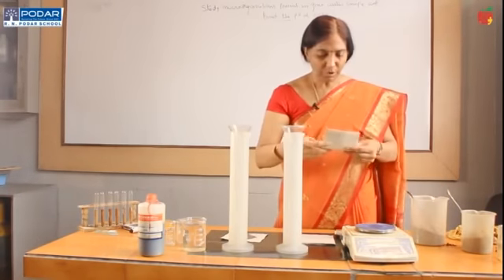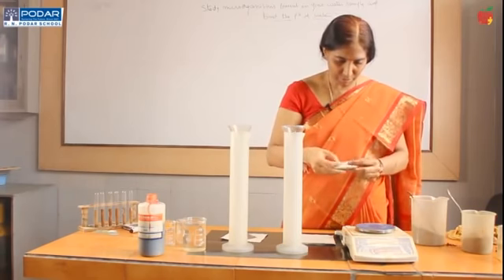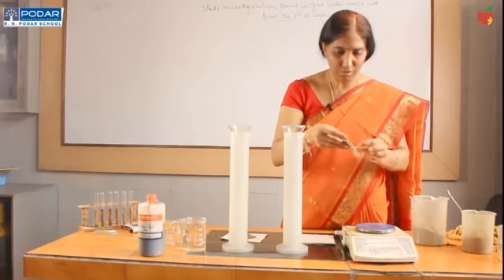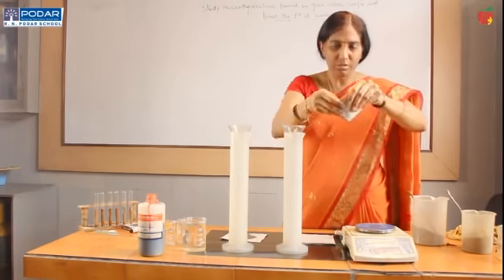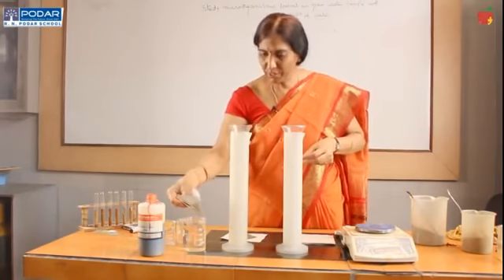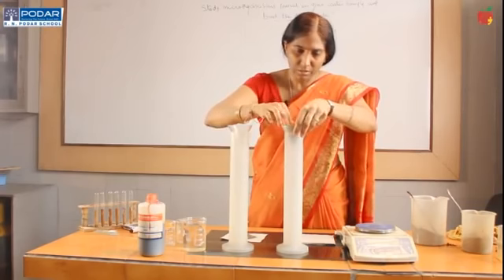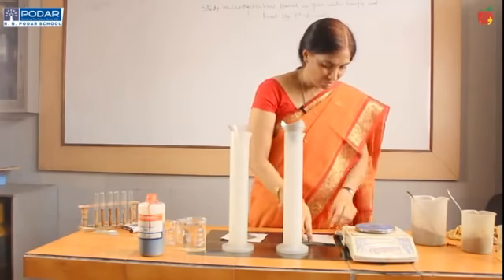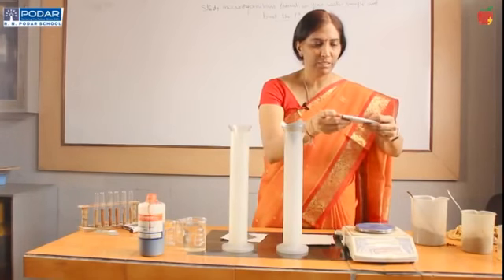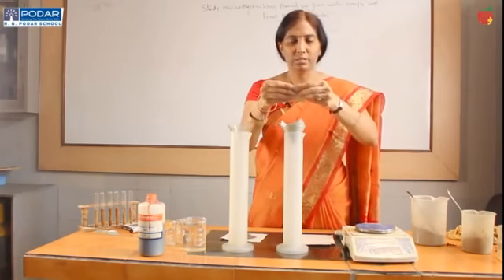Now, I am going to prepare a funnel. I am taking filter paper and folding it like this, 4 folds. You have to prepare the funnel like this, then it should be dipped in water so that the filter paper will stick to the funnel. One more funnel I am preparing, fold like this, first fold, after that like this again.